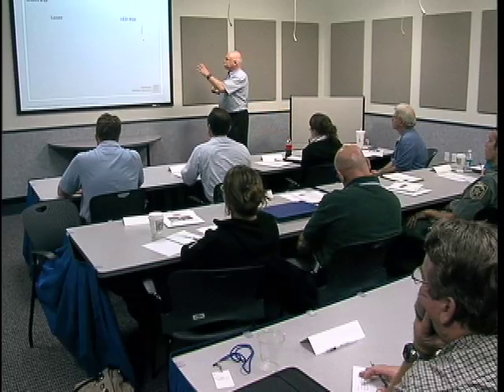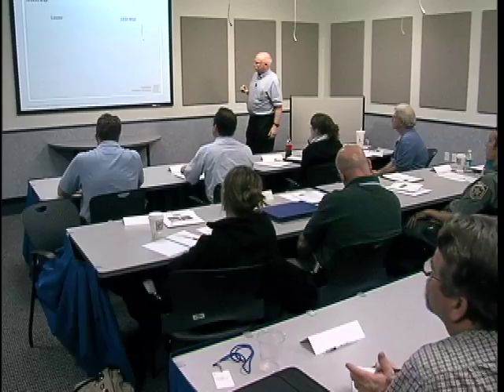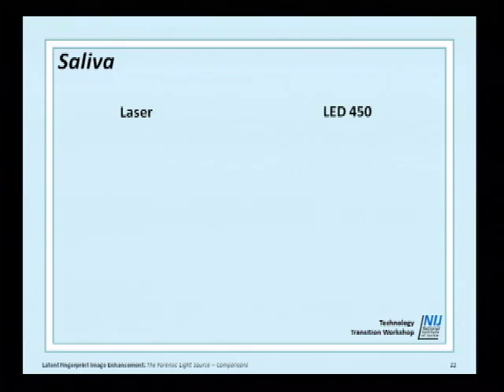So we're going to do some comparative things here to show the difference between the laser, and I just picked one of the sources to do. It got to be a little untenable to do all of them, but the results were pretty much the same, in fact indistinguishable, between the LED and the filtered lamp version, the polylight or the crime scope.